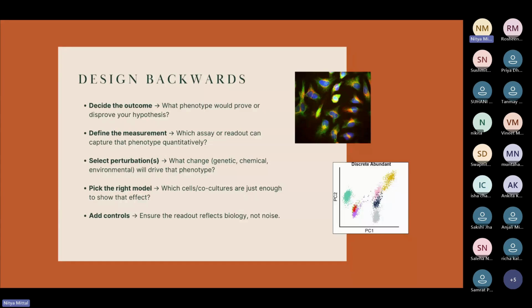You will culture a healthy iPSC. You will take that from an iPSC at day 0 to, say, a motor neuron at day 10. And before you do this day 0 to day 10, you will insert a construct that will give this cell a cryptic neuron or ALS-like morphology, right? So in that case, you have selected a genetic perturbation that will drive the phenotype, which is TDP43 mislocalization. Because this cell now has the ALS construct, it will express mislocalized TDP43 from the nucleus into the cytoplasm, correct?